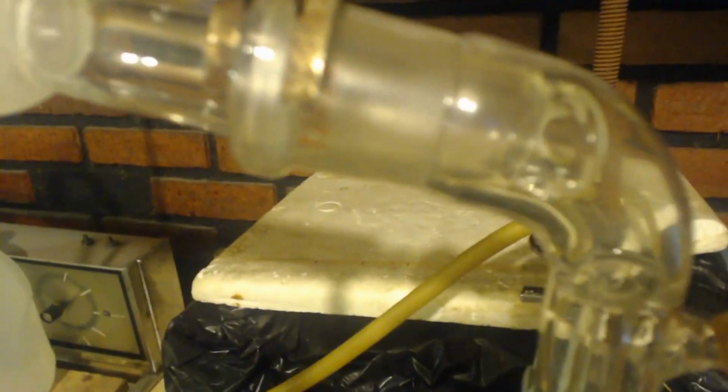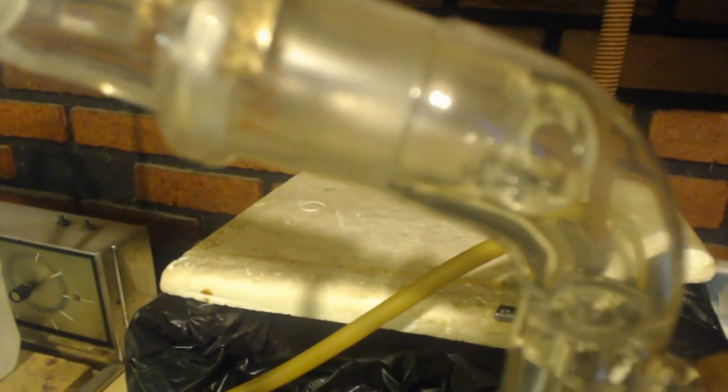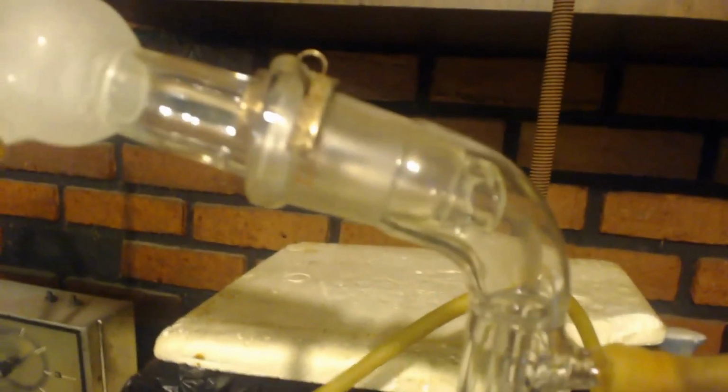Now it is at 42. But it is extremely slow distilling. So I have hopes that maybe there is at least some trichloromethane, which would be chloroform. At least that. We'll see. Because dichloromethane boils about 40 degrees Celsius. Trichloromethane or chloroform boils about 61 degrees Celsius, around there. But I bet I made some chloroform, at least a little bit. Only time will tell.